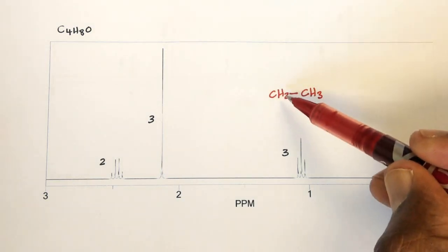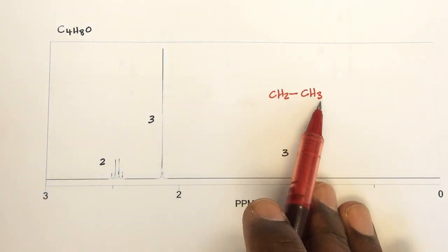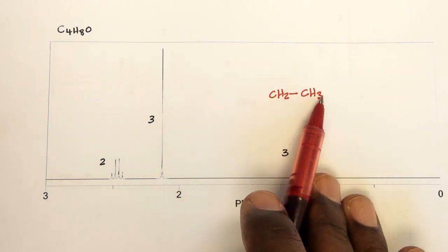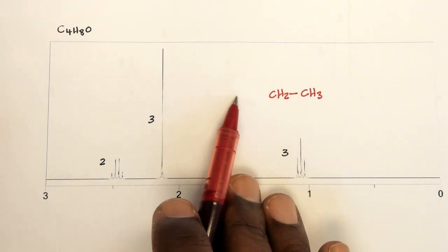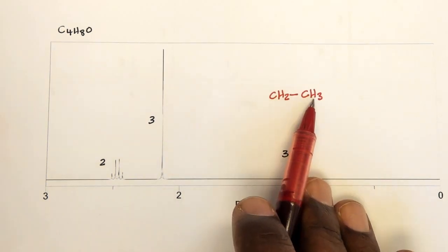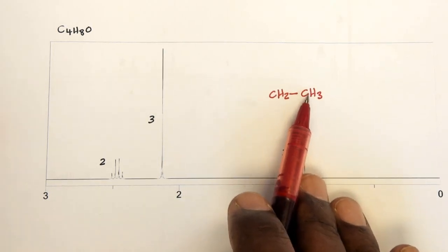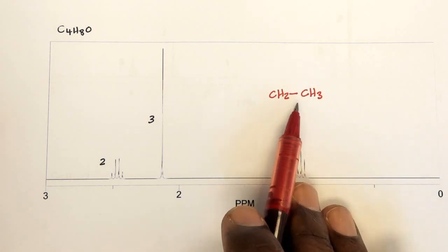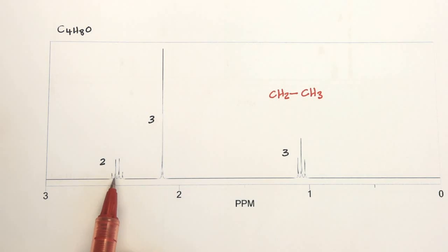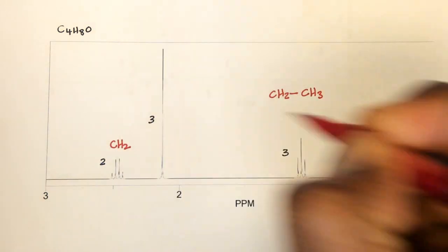This CH2 group is somewhere in the other resonances, being adjacent to the CH3. Now if there were nothing next to it, and by that I mean there are no proton groups adjacent to this carbon other than the CH3, this CH2 would be a quartet because of the n+1 rule. 3 + 1 = 4. And if I look at my region of the spectrum at 2.5, I see a quartet. So it's highly likely that this is the CH2 in this simple spectrum.